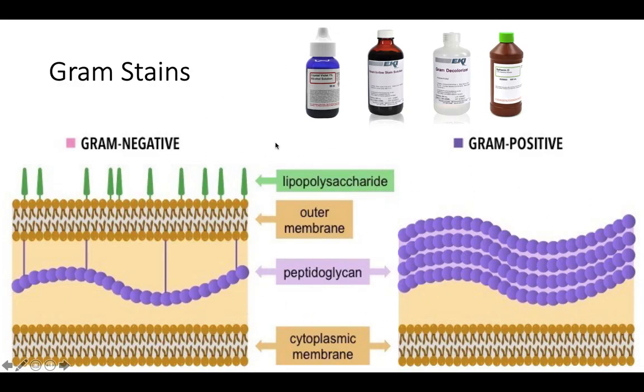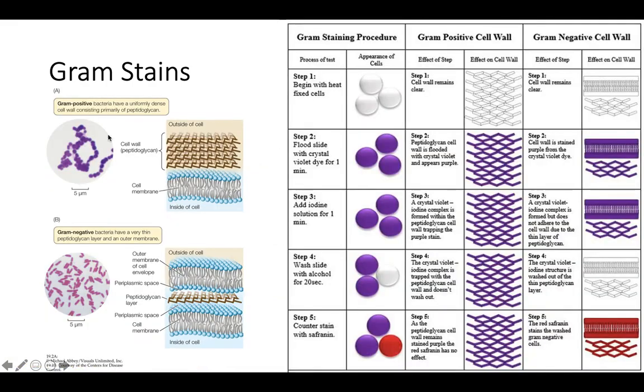start the diagnostic steps. Now, as I mentioned, you will see the gram-positive cells becoming purple, and our gram-negative cells are pink. So over here, you will see the walkthrough of how to do this step by step, the walkthrough of what's actually happening inside of the cell membrane here, inside of the cell walls, inside of the peptidoglycan for our gram-positives, and the same thing over here for our gram-negative.